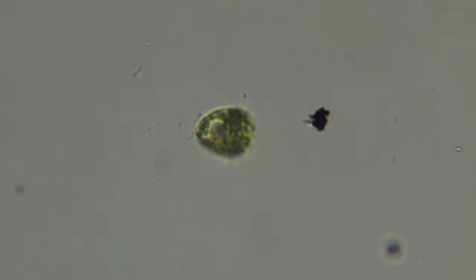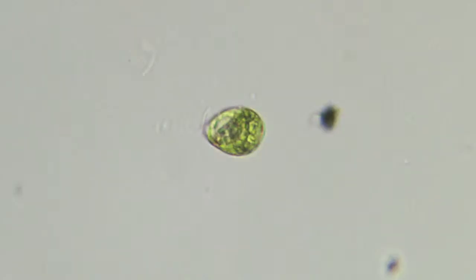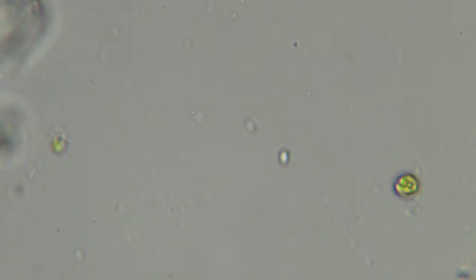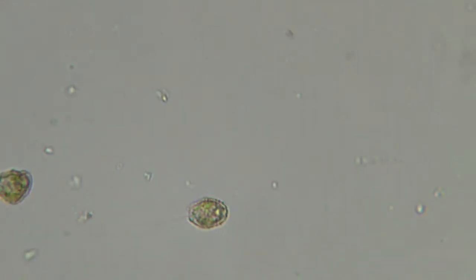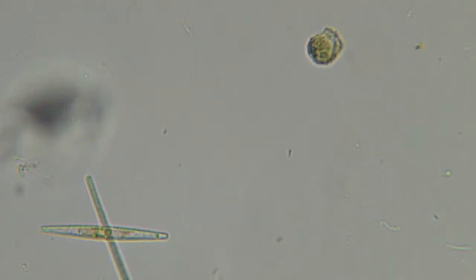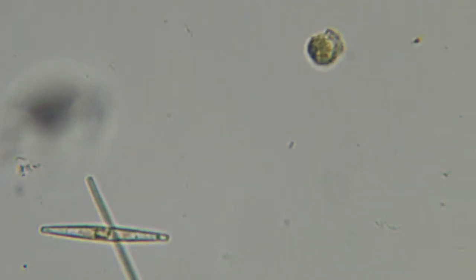Nice little dance of the flagellum there on the margin. Gotta change the exposure to see it sometimes, or the focus. Again, the phase contrast shows all this stuff in much greater detail. I'm gonna have to do that. Or at least more contrast so it pops from the background. There's those little flagellated guys with the little bumpy walls there. Let's look that one up. Just crossing diatoms. Actually, wait. It's actually a diatom and a cyanobacterium.